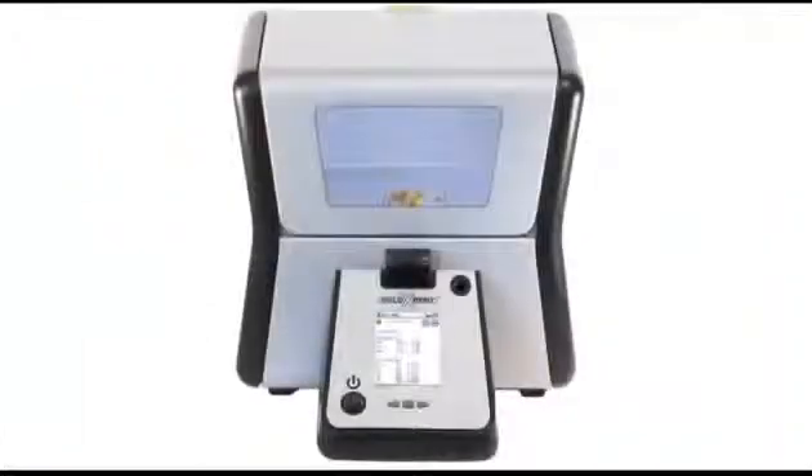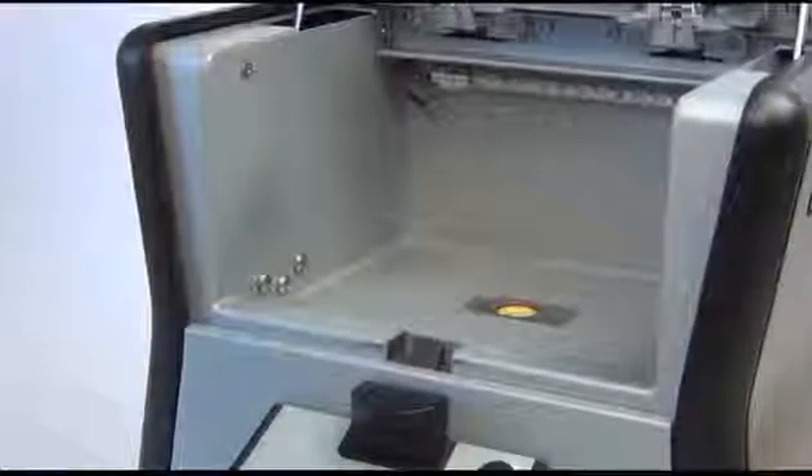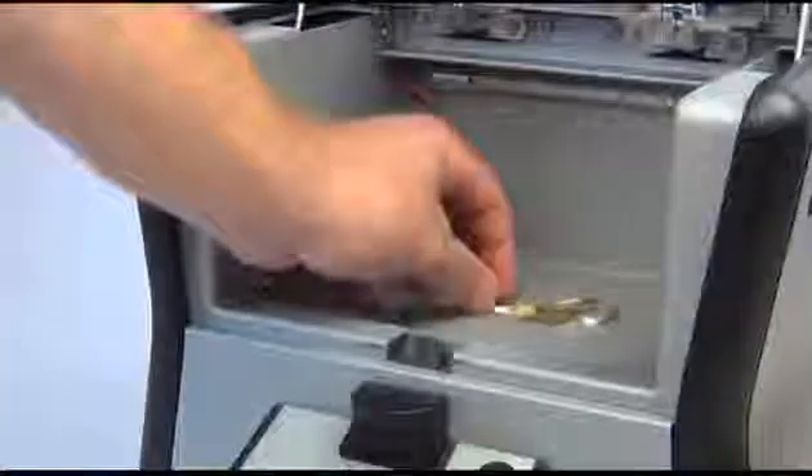The Gold Expert from Olympus was designed with the jewelry industry in mind. Its small footprint won't take up valuable counter space and it can test any piece of jewelry in seconds. Testing couldn't be easier — just place, close and tap.